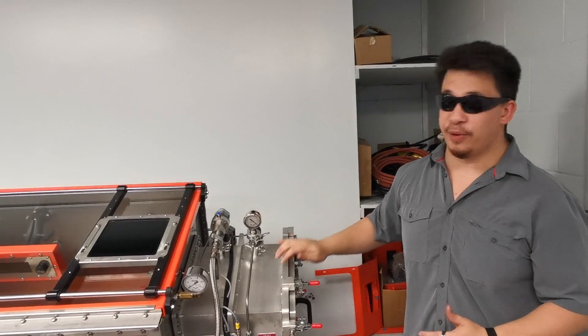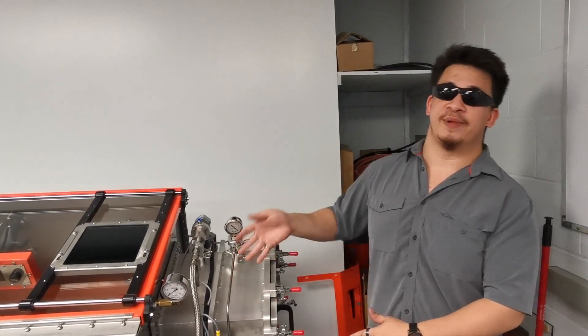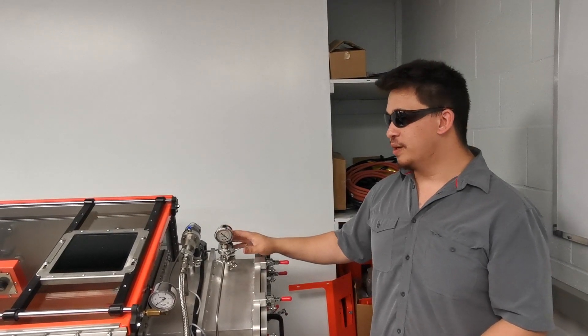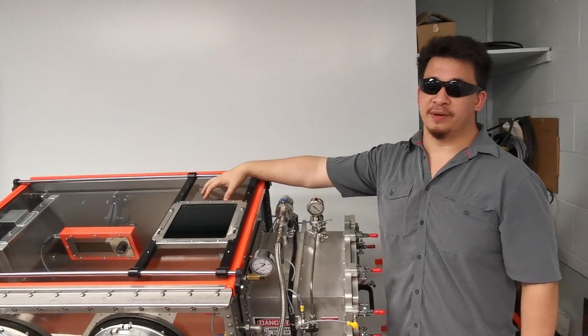There's another option where we can have a purge anti-chamber where we pour argon or helium in to displace the oxygen out through a bubbler system that we've developed, which is a less premium option, or you can essentially put your parts in and purge the whole chamber once.